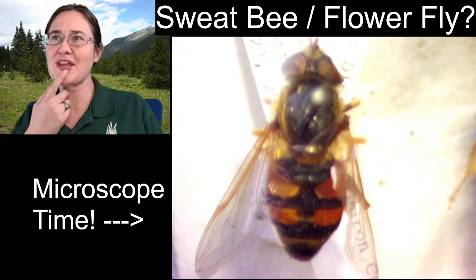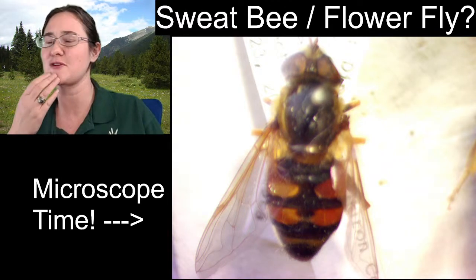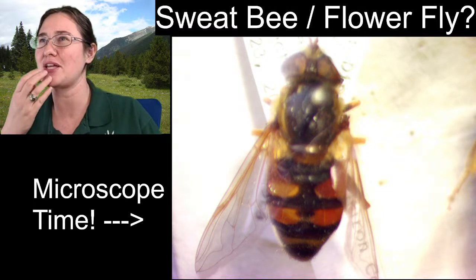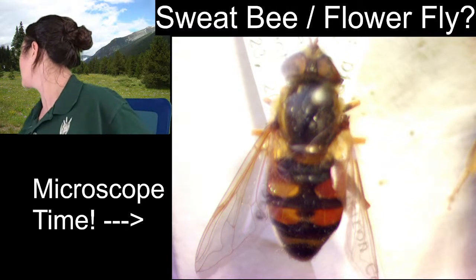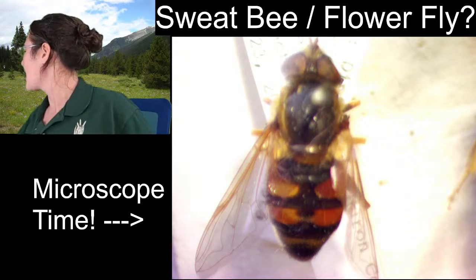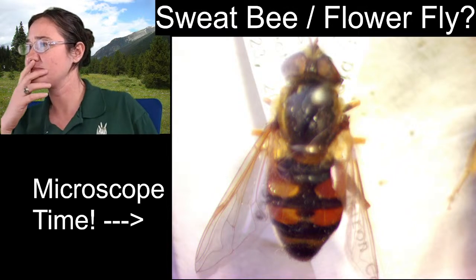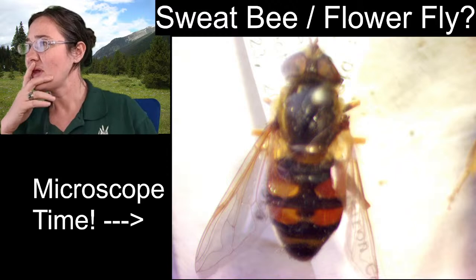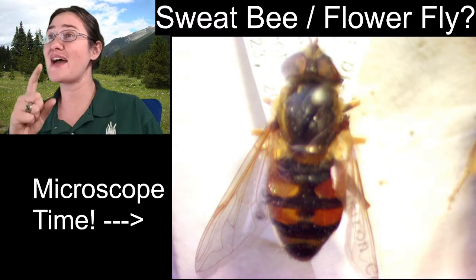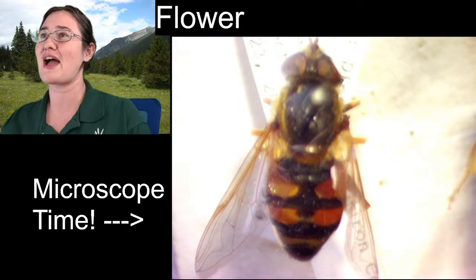It is possible that I will find other specimens, too, if there was another specimen that we wanted to sketch. I was trying to think of pollinators that we haven't done yet. I could go into my collection and find a butterfly we haven't done. Flower fly sounds a little more interesting, and we haven't done a dipteran in a while. That's true. All right, so we're going to do the flower fly.